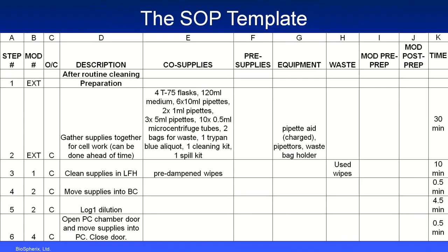Now, this is the SOP template. This is something that can really help you plan your process. So like you saw in that general plan I just had on the previous slide, in order to be able to perform the post-process disinfection without bringing more items in, I need to have them in place when I start the process at the beginning. This is the most efficient way to do it.